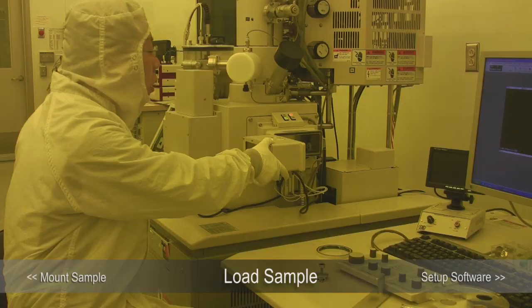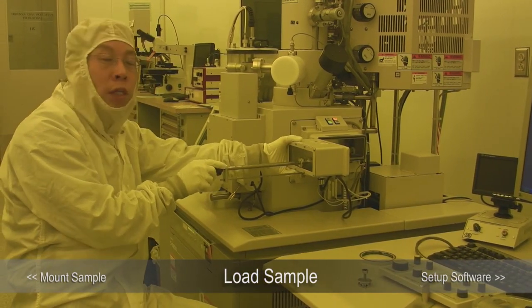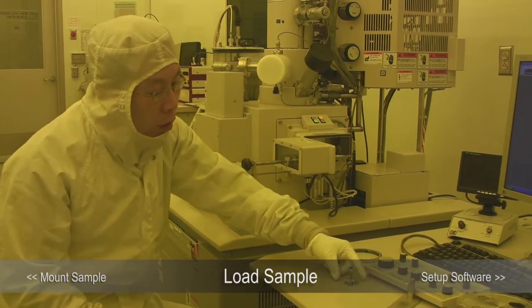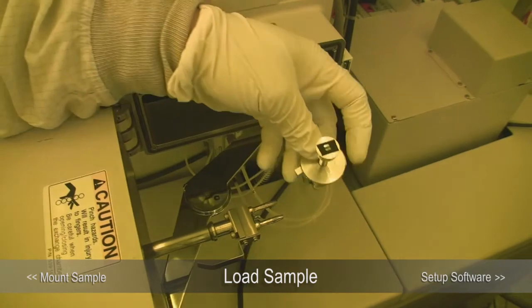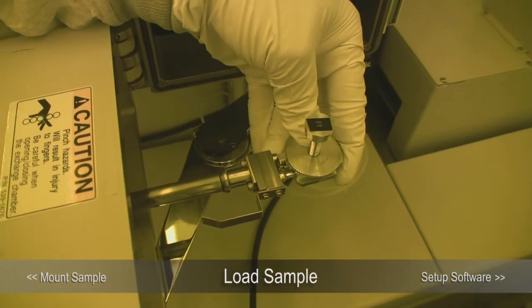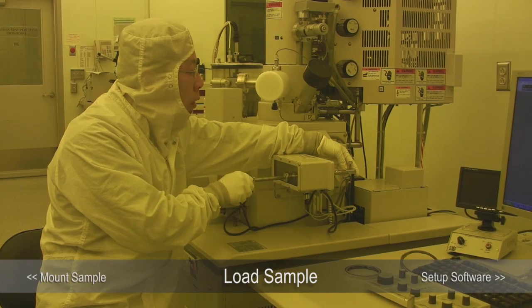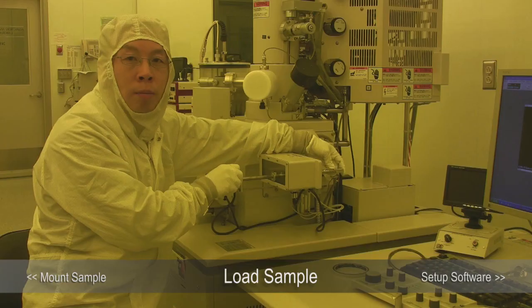Once you open the door, we will push the exchange lock in. You can see two points here which go into these two holes — that's how we mount our sample holder. Zooming in, you will see there is a mechanism that turns and locks the sample holder. Now you cannot take it out.